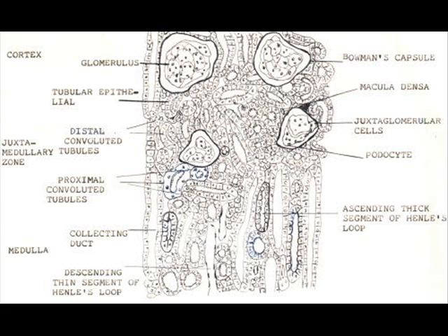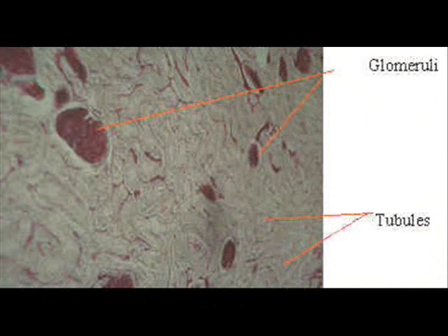The main diagnostic feature of the kidney are the cortical glomeruli, which may be confused with islets of Langerhans in the pancreas. A differential diagnosis of the kidney can be easily made out from the thyroid and pancreas by examining the features of those glands.